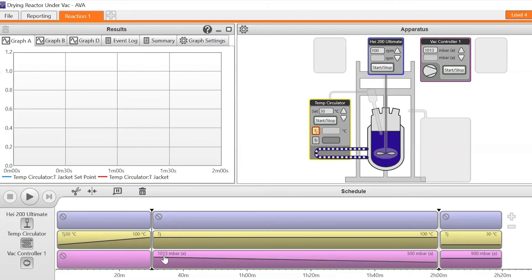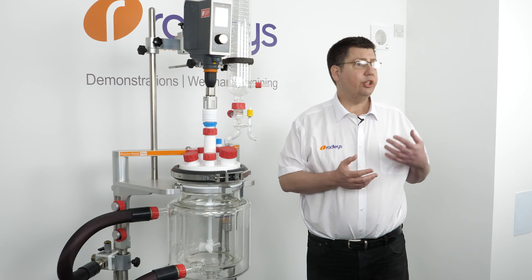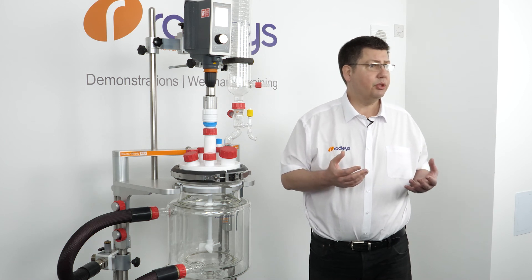After a period of time, that can be held until the chemist returns. Now that the reactor is dry, it can be purged with argon or nitrogen. This is usually done using a vacuum manifold or schlenk line, a common piece of laboratory apparatus found in most chemistry labs around the world.